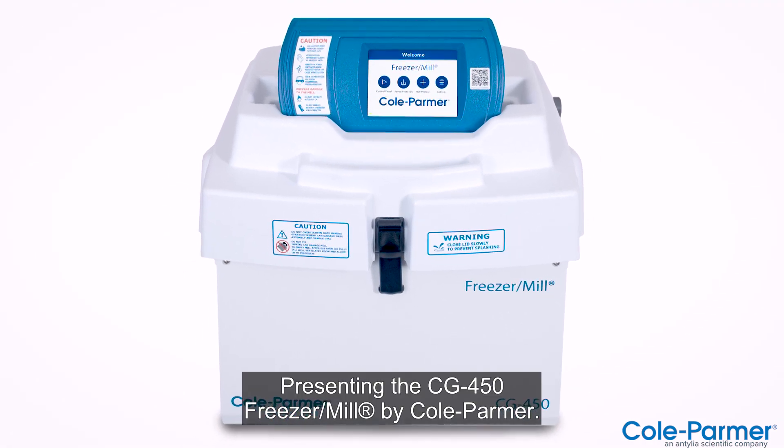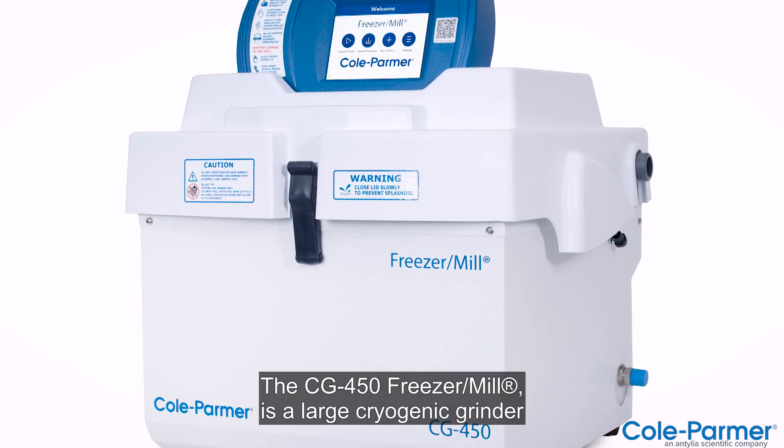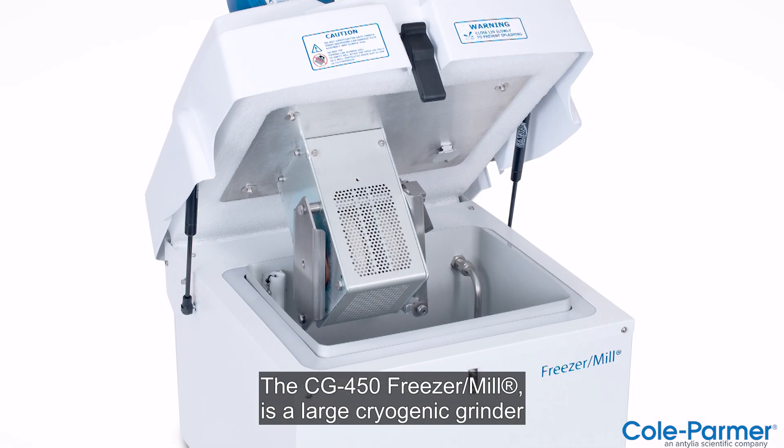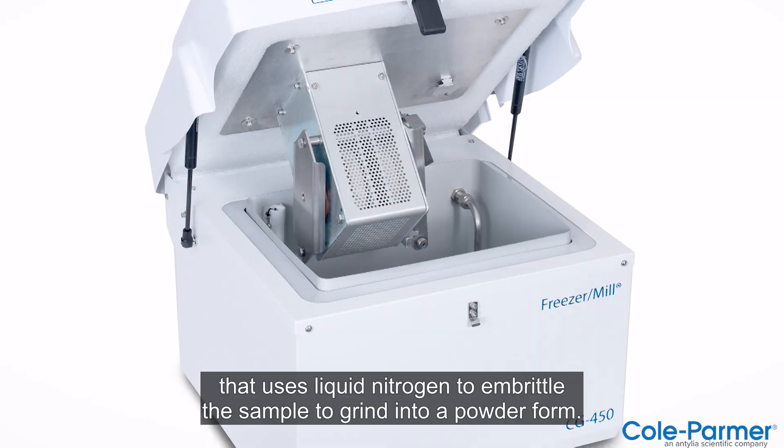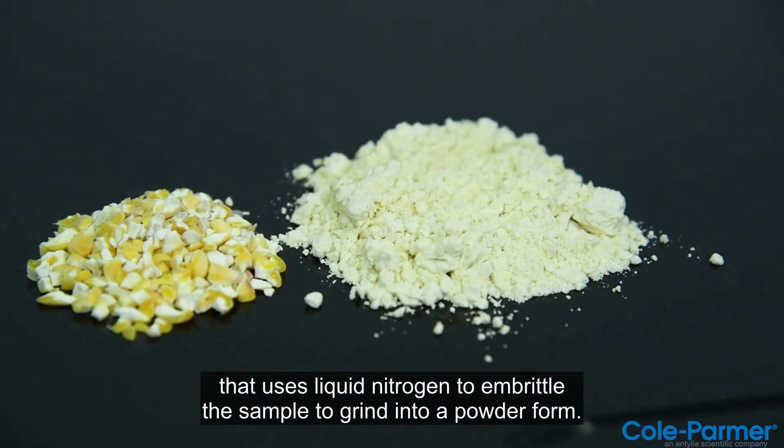Presenting the CG450 Freezer Mill by Cole Palmer. The CG450 Freezer Mill is a large cryogenic grinder that uses liquid nitrogen to embrittle the sample to grind into a powder form.